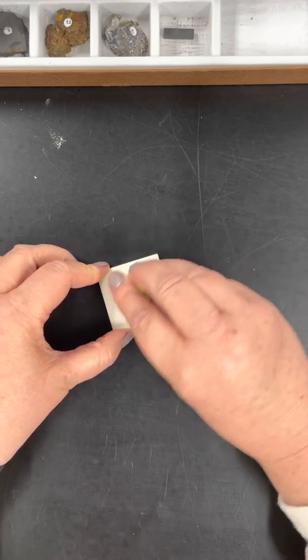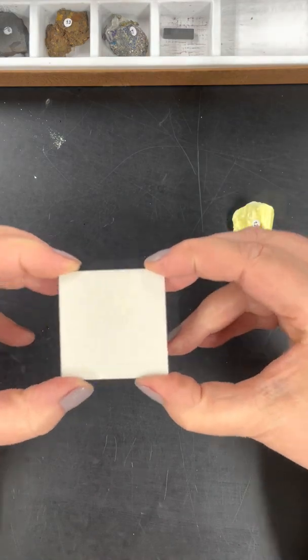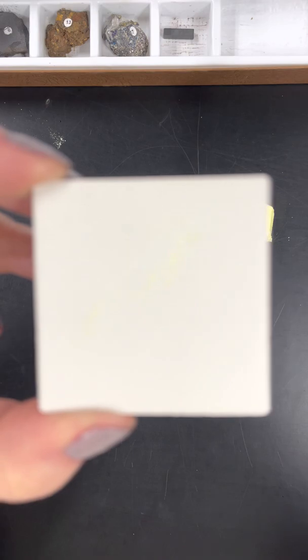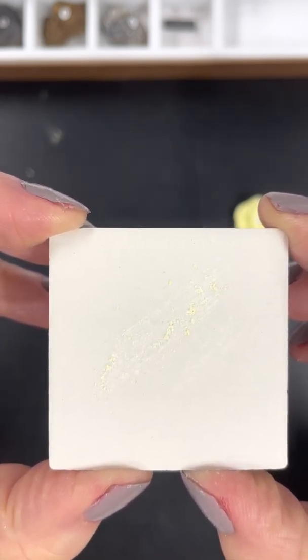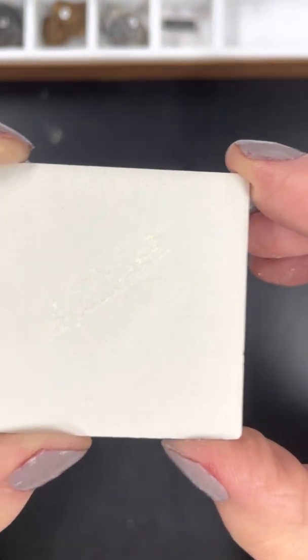You literally just scratch it on the streak. Okay, now I'm going to bring this up to you because I want to show you something. Let me get it focused just a second. There we go. Now you might see some really light, fine powder, and it's yellow. That's not what you're looking at. Let me kind of blow that off.